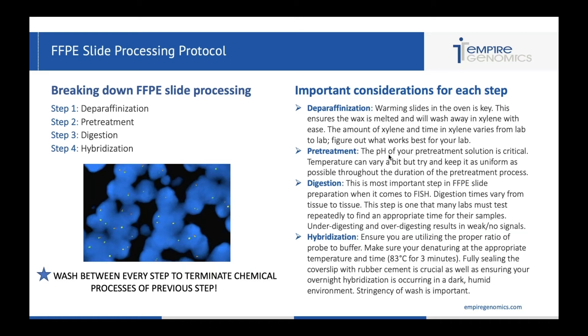Our last step is hybridization. With FFPE slide processing, you definitely want to make sure you're utilizing the proper ratio of probe to buffer. Labs think that because it's tissue you need to use more probe and less buffer, when really they tend to have a digestion problem causing weak signals. You really only need two microliters of probe and eight microliters of buffer for a total of 10 microliters per cellular area. It doesn't need to be more complicated than that — if you're using the right protocol for that probe, you shouldn't have to use more probe.